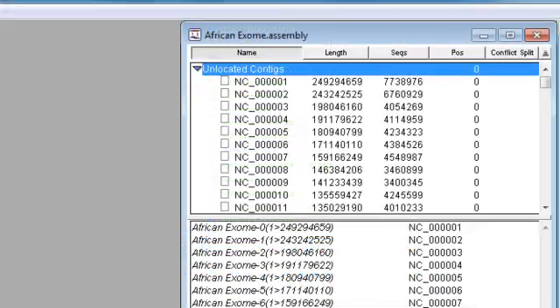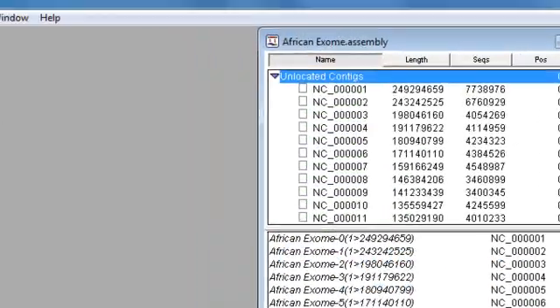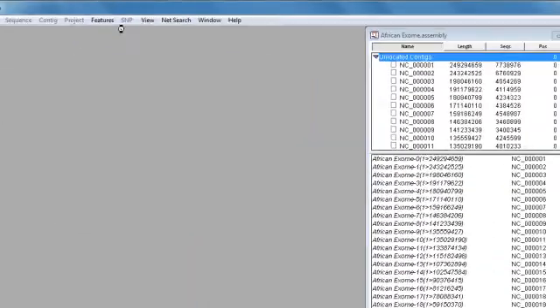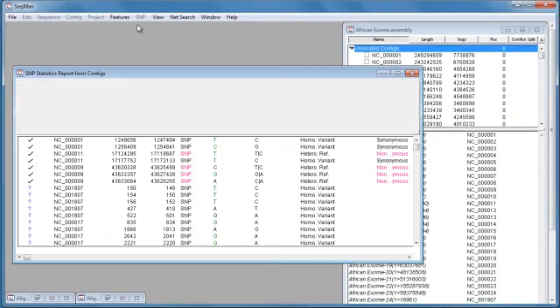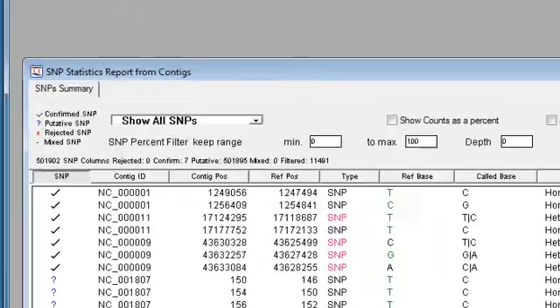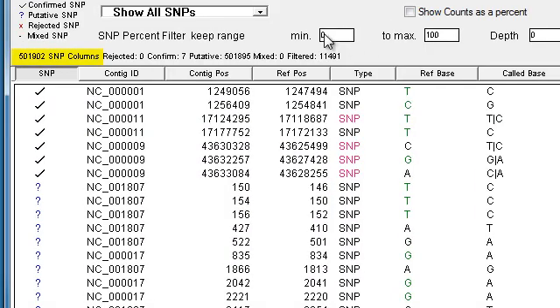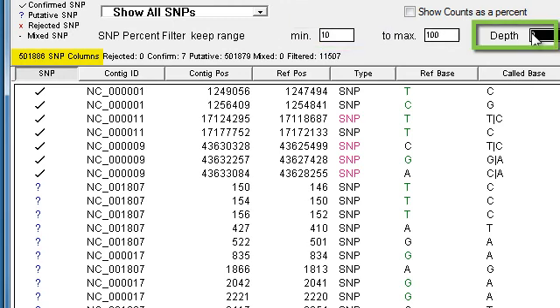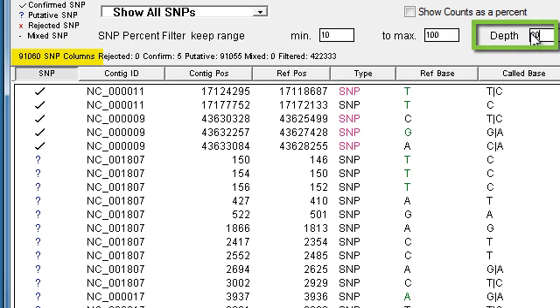So here I'm going to open the SNP report and you see we have about half a million SNPs. And by just applying some basic filtering, I can narrow this down to about 90,000 SNPs.